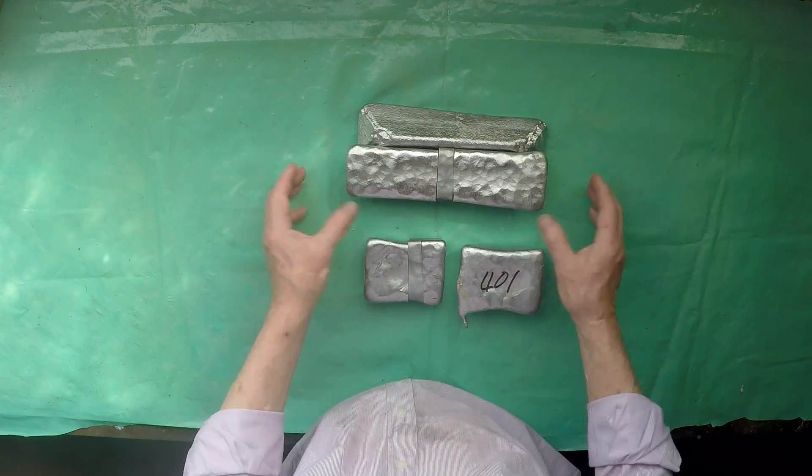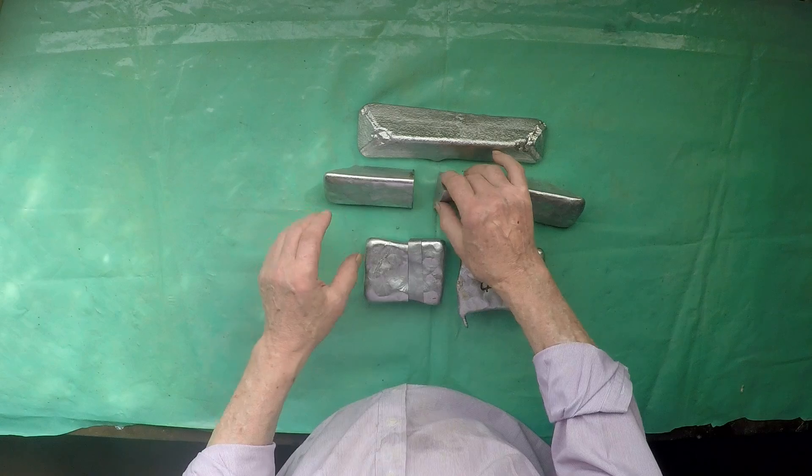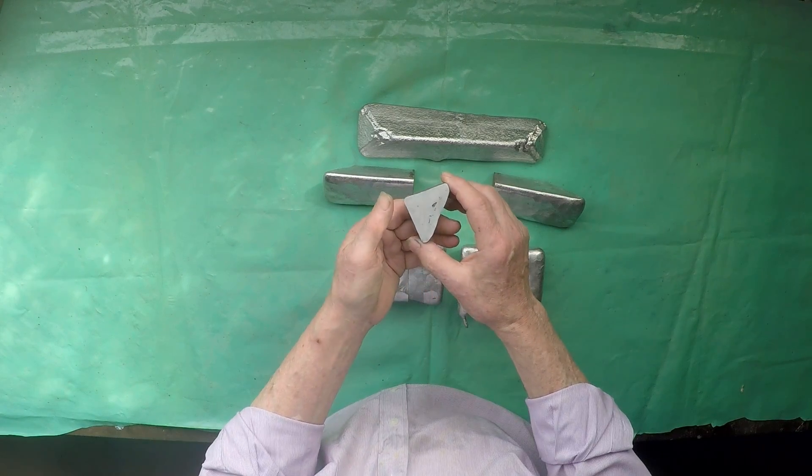So what I did, I got one of the ingots that showed this quite badly, this one in fact, and I cut this slice out of it and I did some work on polishing and etching this sample.